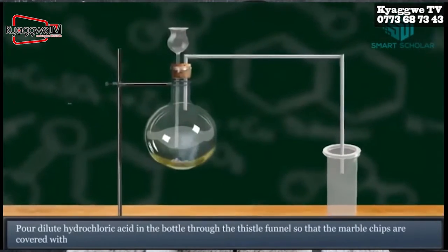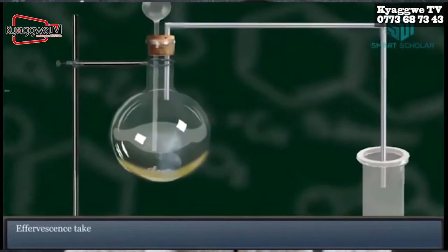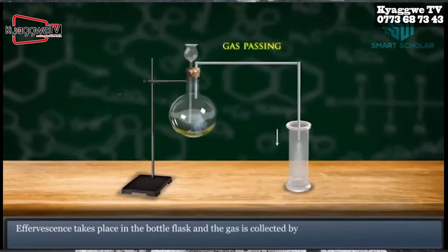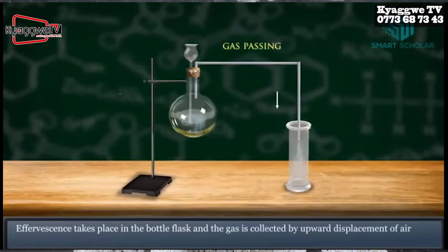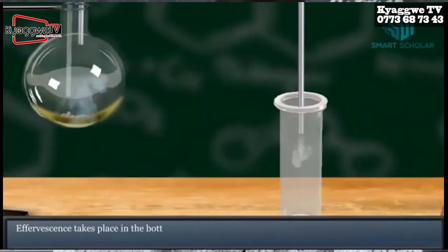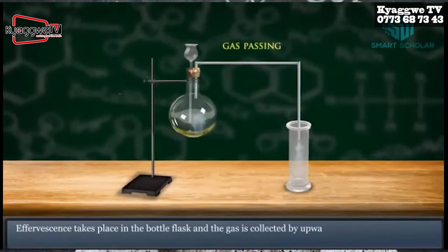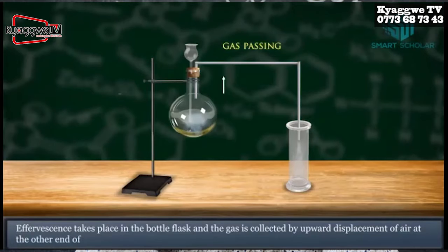Pour dilute hydrochloric acid through the funnel so that the marble chips are covered with the acid. Effervescence occurs, and the gas is collected by upward displacement of air or downward delivery in a collecting jar. This is how carbon dioxide is prepared in the laboratory.